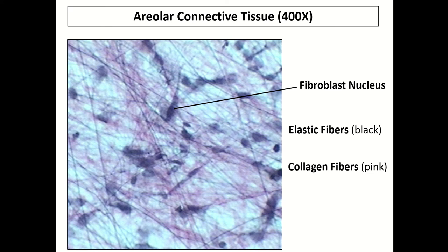So these protein fibers themselves, there tend to be three types we look at in connective tissues. We can see two of those types here. Collagen fibers are pretty easy to spot. They are these pink or light purple fibers that you see all throughout the tissue. They're going to provide a lot of strength and resilience. We're going to see them all throughout connective tissues. So just keep a note here that these are these pink fibers, giving a tissue this pink color under the microscope.